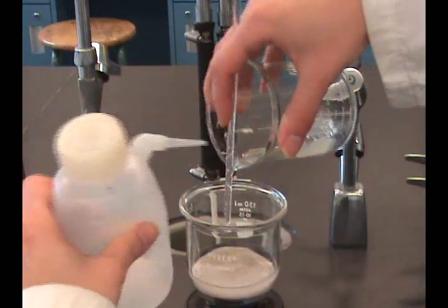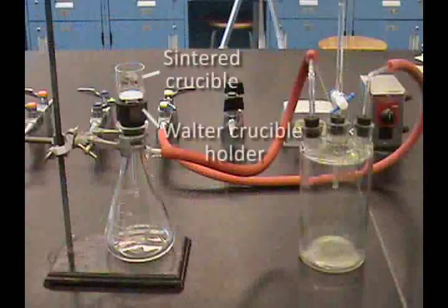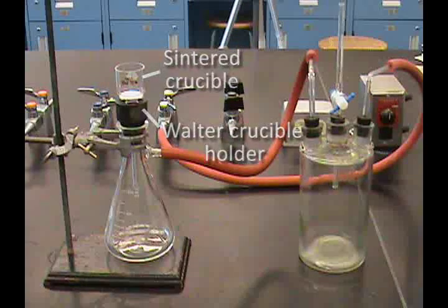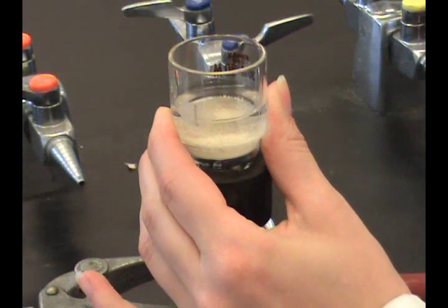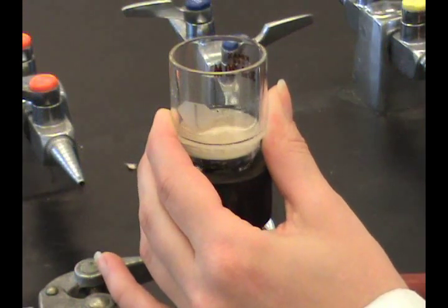Wash the solid. When using a sintered crucible, a Walter crucible holder is required. The liquid should flow quickly through the frit. If not, cleaning in a one-to-one nitric acid solution is suggested.